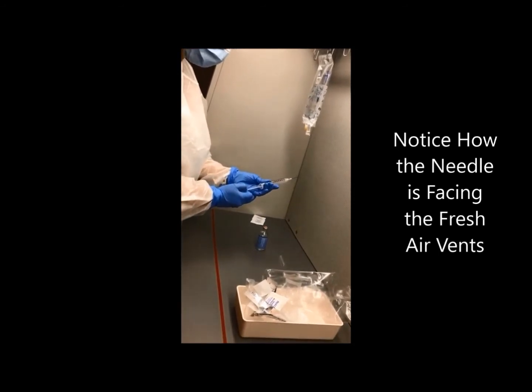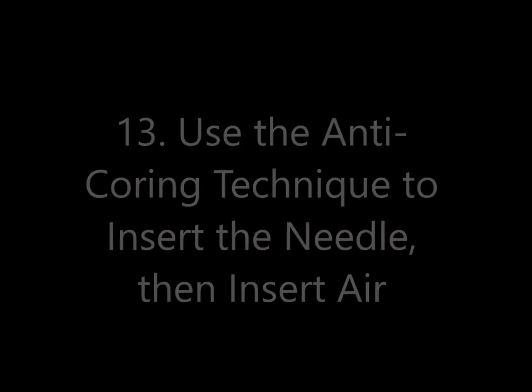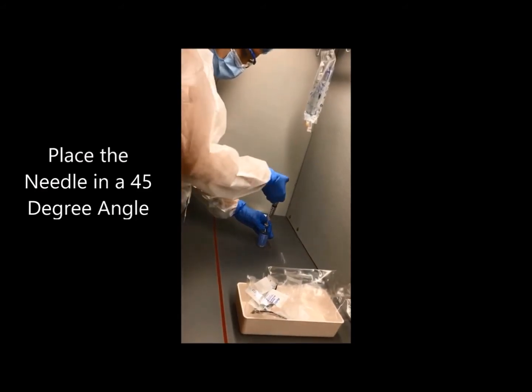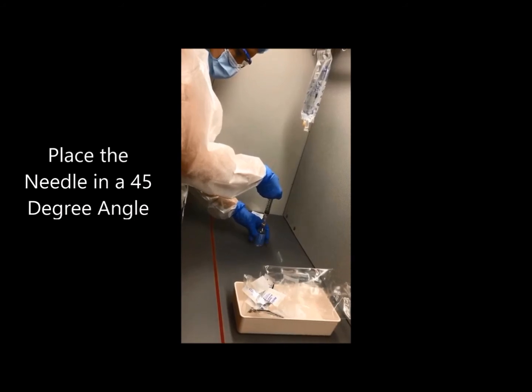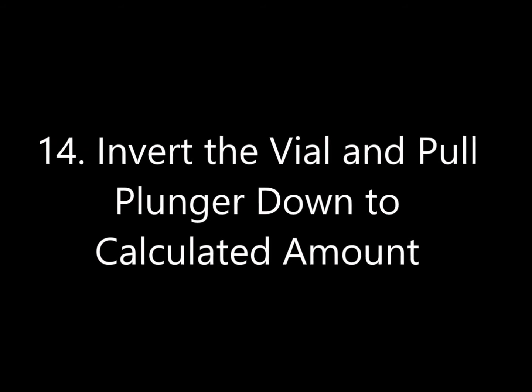Please notice how the needle is facing the fresh air vent. Step 13: Use the anti-coring technique to insert the needle, then insert air. Place the needle into the vial at a 45-degree angle. Step 14: Invert the vial and pull the plunger down to the calculated amount.